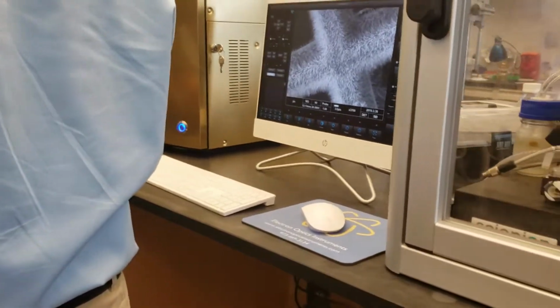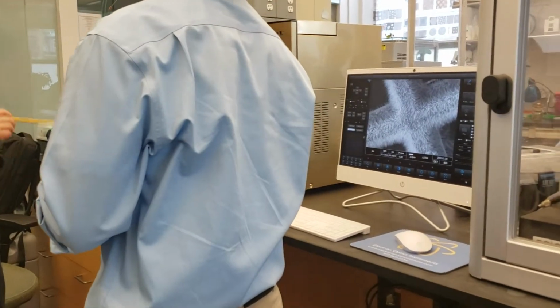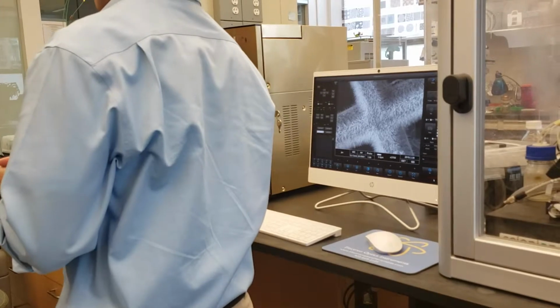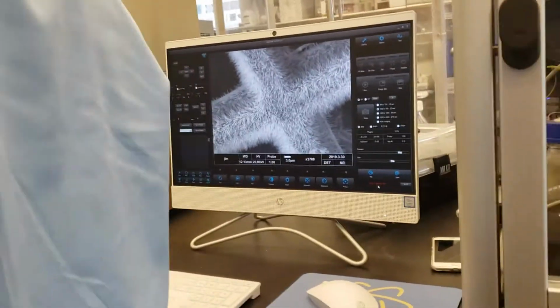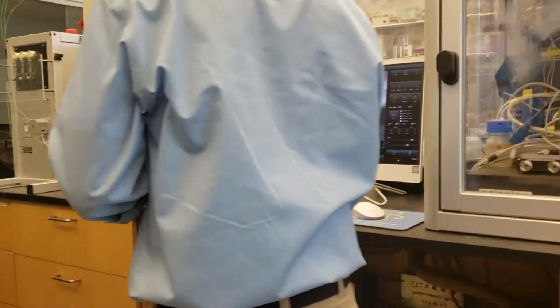Okay. So you recommend to keep the chamber under vacuum? Sure. Yes. So after we pump the chamber, just turn off the power. You could do that, yep. That would leave vacuum in there, that's correct. You should always leave vacuum in the tool, because of humidity and contamination. It should always be left under vacuum. I'm going to go over that with you guys.